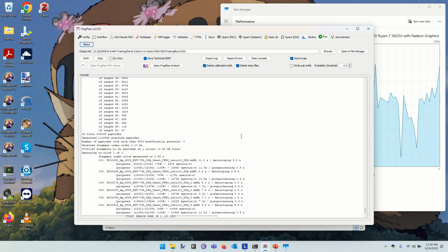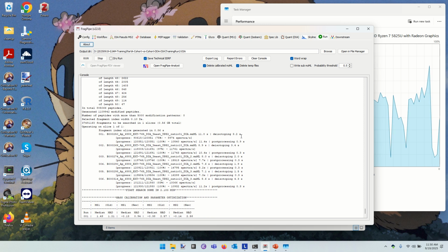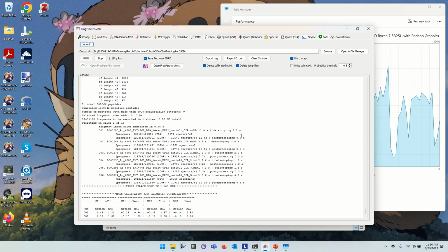If it doesn't do that, it's because you don't have the reanalyze flag attached. And it would actually almost surprise me if it was on by default because you cannot turn it off then. I see. And there could be situations where you want to turn it off. Well, we will try to spot that in the output as it goes. Yeah, just a heads up, this might not do MBR then. It's possible, I guess. As I said, it seems like something that so clearly needs to be included.